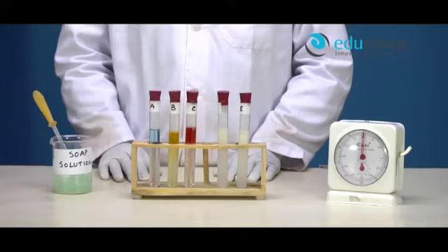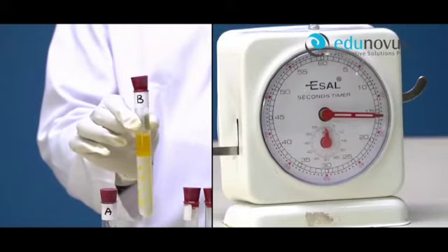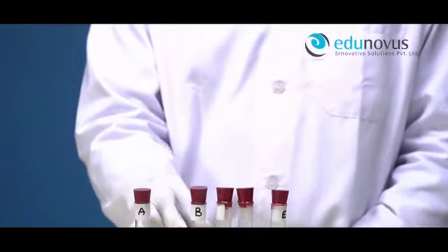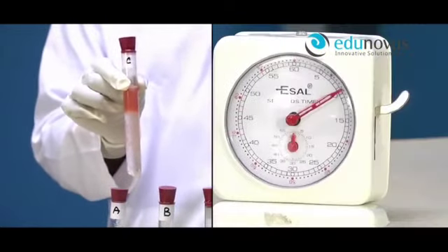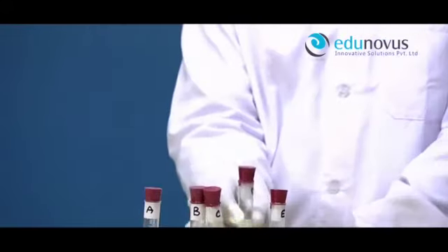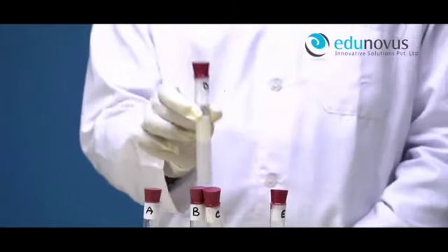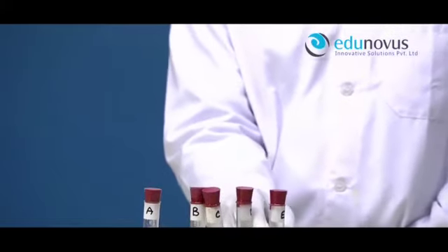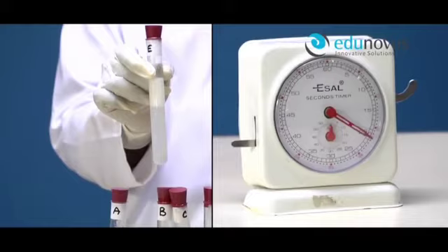Now similarly add 10 drops of soap solution to the rest of the test tubes and repeat the experiment. Time taken by test tube B containing mustard oil is 16 seconds. Test tube C containing machine oil is 10 seconds. Test tube D containing castor oil is 17 seconds. Test tube E containing coconut oil is 22 seconds respectively.